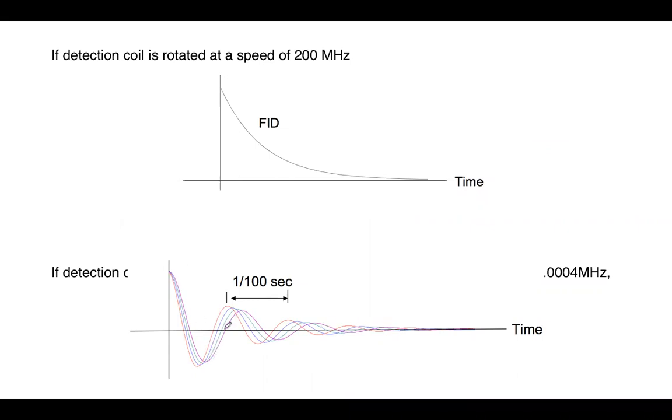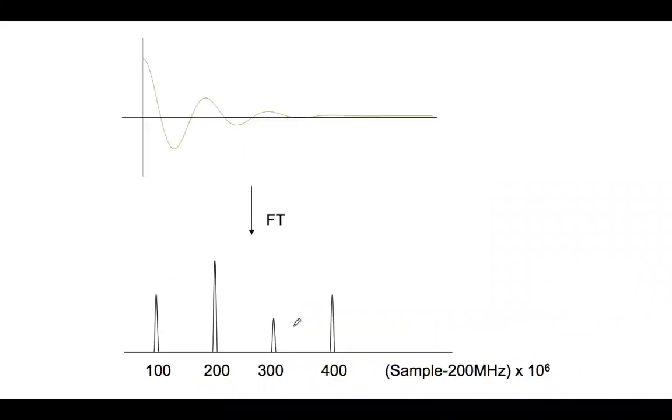So what we were doing there was a single dipole moment, but those dipole moments are actually the nuclei of a molecule. So there's a lot more going on than just one signal. There can be a great many different signals, and we can detect all of them and Fourier transform them all to get back to the original state. So we get the combination of all of them. It looks something more like this, where we've got constructive and destructive interference.